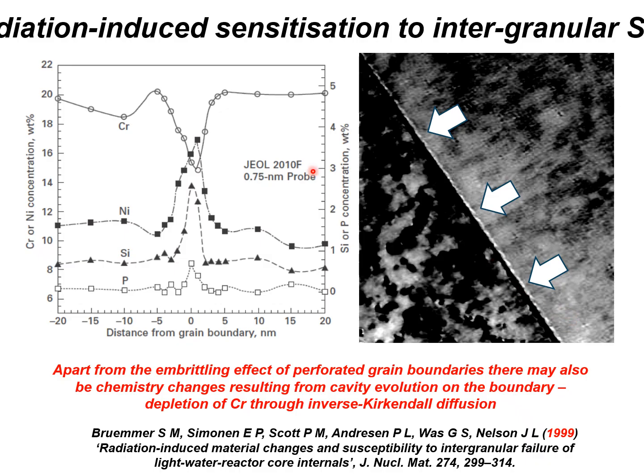Now, the segregation, again, that's something that's been very ambiguous, flaky, how it's been interpreted. And I think a lot of that often is because people were not aware that you have this sink on the boundary. So when you radiate and you create helium, helium is very mobile, and it is not absorbed by grain boundaries like vacancies are, but it will migrate to the boundaries and stick there.